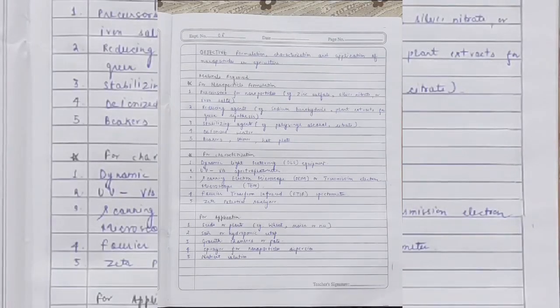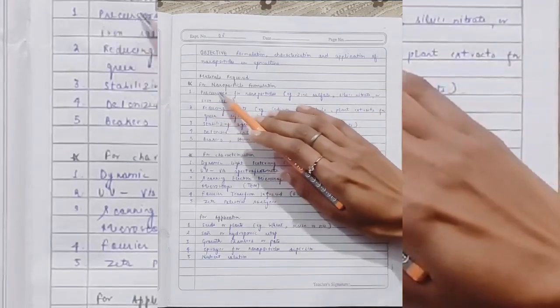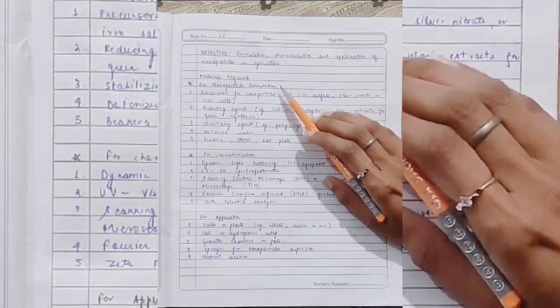And I, Jagriti Bhatt. Today we are going to explain the procedure for formation of nanoparticles in laboratory conditions. So here are the materials required. For nanoparticle formation, the materials required are as follows.